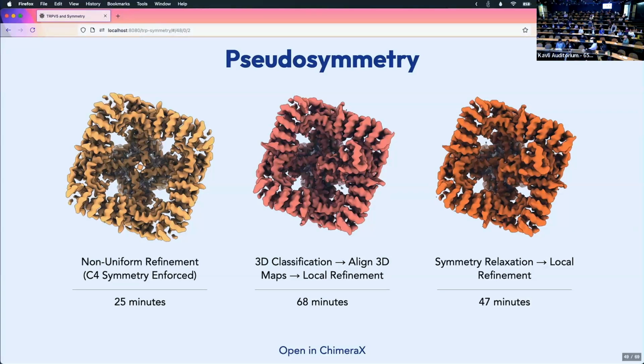with two copies of calmodulin in your final map. You don't have enough perturbation here. Definitely. There's definitely still a chance. And if that happens, there's a few things you can do. One is, of course, you could try the classification approach. Like I said, there's many ways to approach all these problems. Another thing that you could try is erasing manually some of the calmodulins.